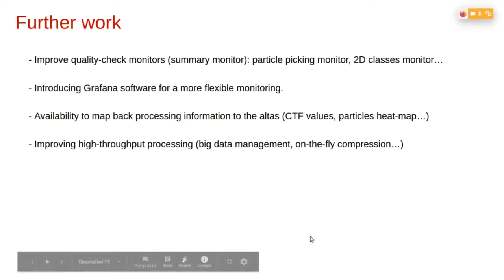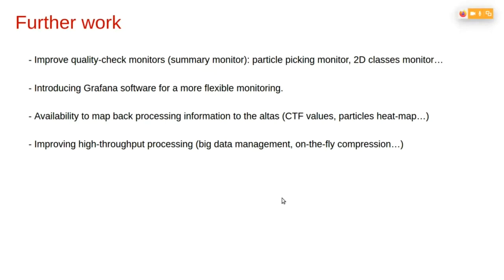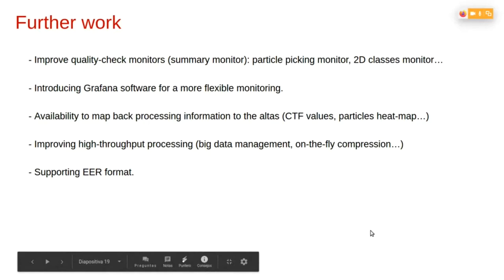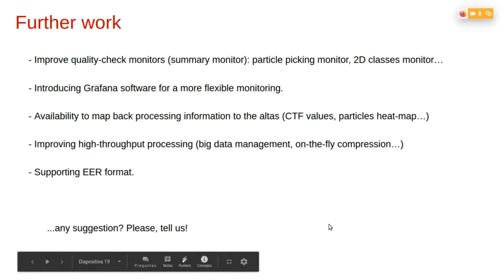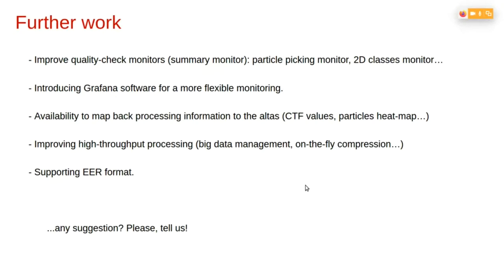Also now we are working on big data management and how we can compress information on the fly, not only to save space, which is very important, but also to improve the performance of the workflow and the processing. And of course, we are working on the EER format in order to give support through Scipion. And we are very open to your suggestions in order to improve Scipion and to fit your needs in Scipion.